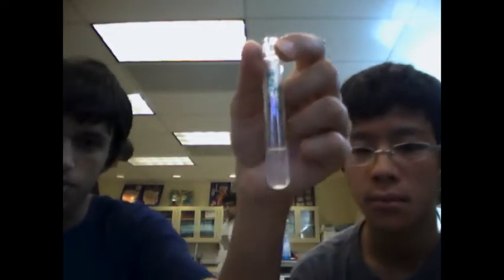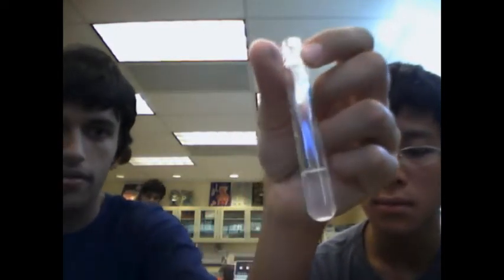Here's the second test tube, where we have 1 milliliter of water and 1 milliliter of catechol oxidase. Notice the color. It didn't react, and there's no benzoquinone produced. This is because there was no catechol. You only have two parts to your reaction, to your equation. Without the catechol, there's no catechol oxidase reaction.